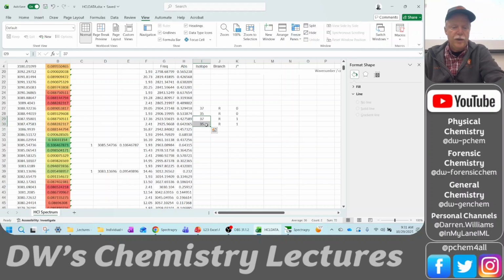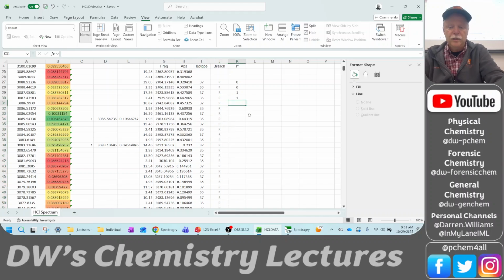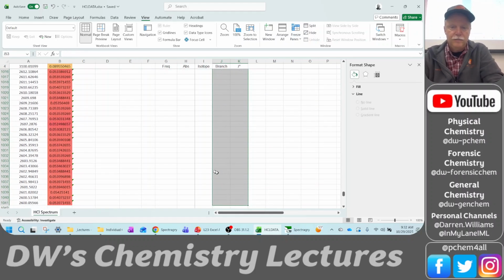So we take this same pattern, copy it, go all the way down, paste it. Okay. R all the way down. This equals that one. So I'm skipping one, plus one. So then this will go all the way down. There we go.